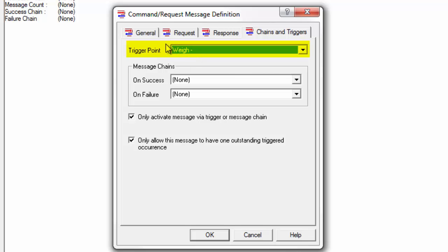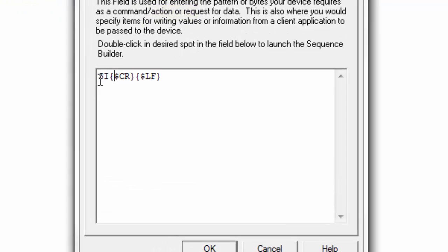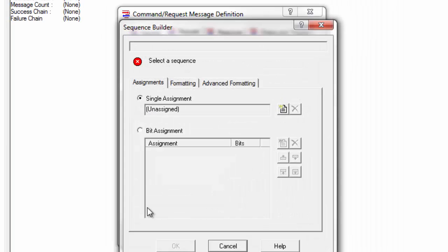Currently the trigger point on this is an item named 'Weigh'. This command is only ever going to get sent if you write a logical true or one to this item from your client application. If we go to the request section, this is the command that's actually being sent to the device. Since the commands are just ASCII characters, you'll see there's just a capital S and a capital I typed in here, and then we have a carriage return and a line feed, which is our special syntax in Omni Server.